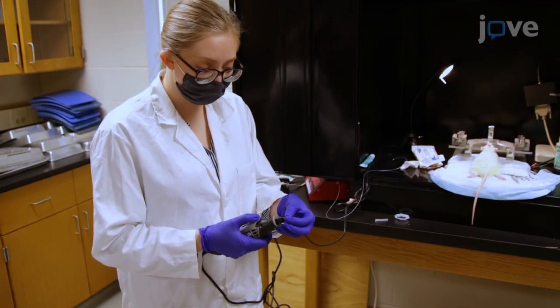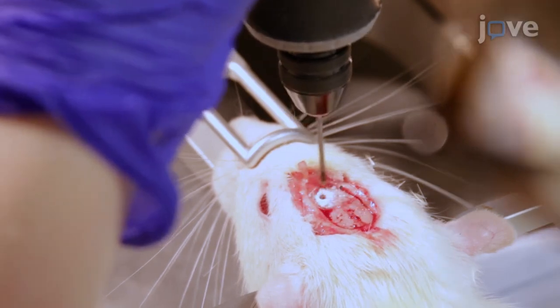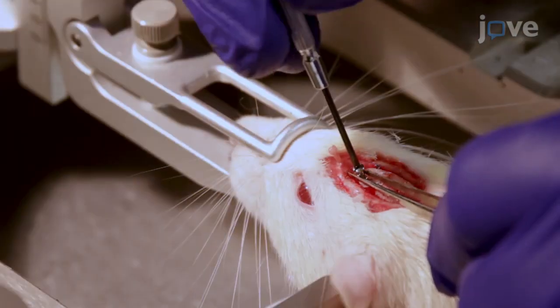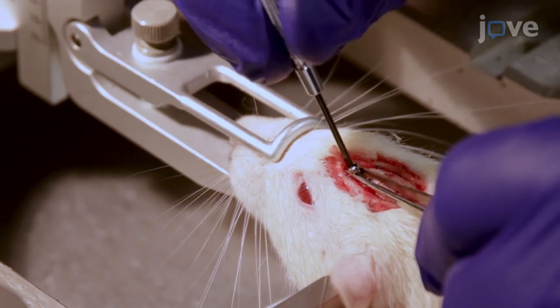Next, use a one millimeter drill bit set to approximately 20,000 revolutions per minute to make a 1.5 millimeter diameter hole 2.5 millimeters anterior and 3.5 millimeters lateral to the bregma. Implant a 1.59 millimeter outer diameter, 3.2 millimeter long screw about halfway into the hole until the screw is firmly in place.